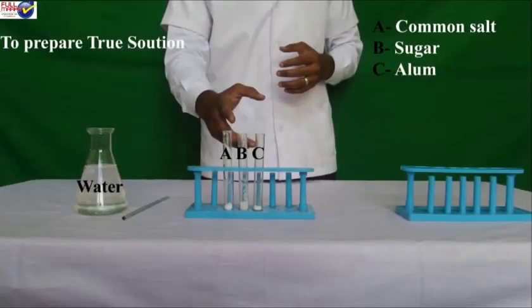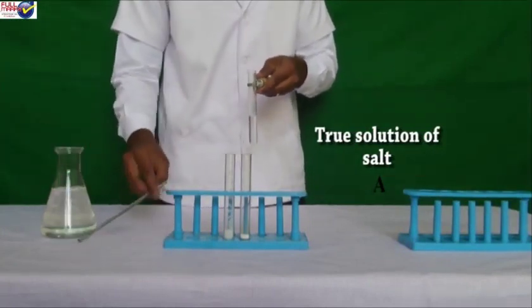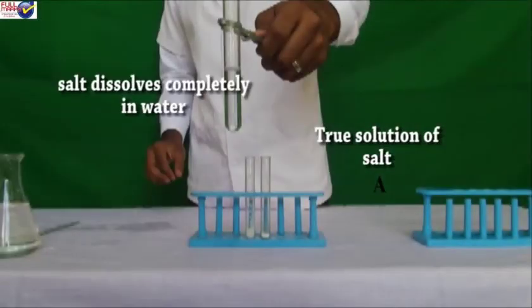Procedure: A. To prepare a true solution of common salt, sugar and alum. True solution of common salt. Take a clean test tube, pour 2 to 5 ml of distilled water in it and add dry common salt in it. Stir the content with a glass rod. Common salt dissolves completely to form a true solution.